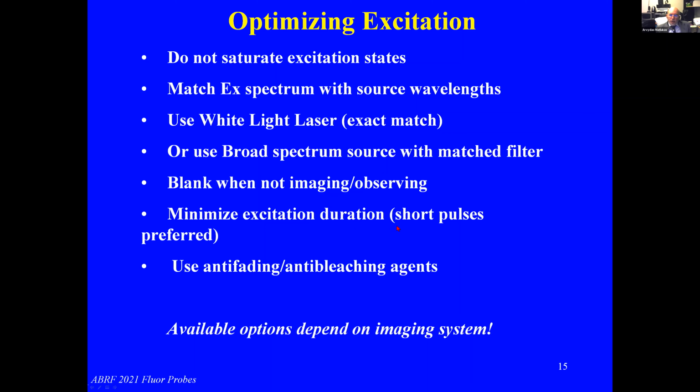Now, in practice, we use several probes or several labels simultaneously because we want to address our specific research questions.